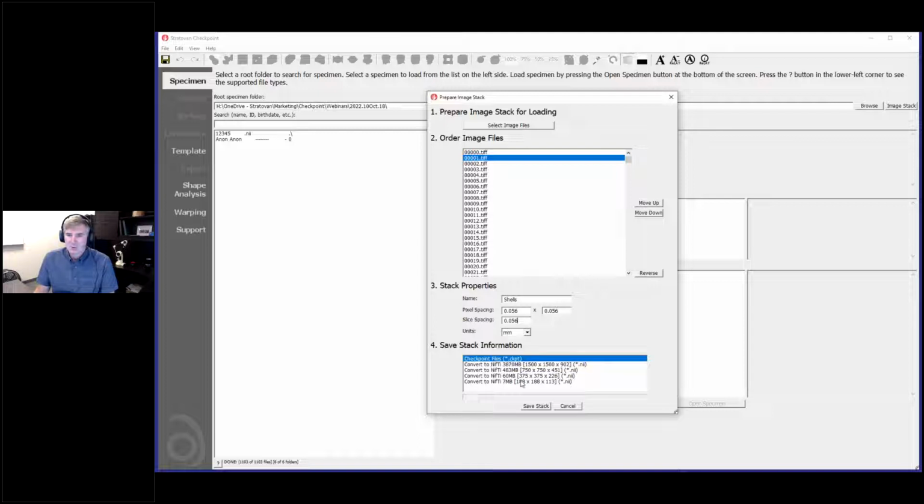So the different output files are, one, you can just do a checkpoint file, and then the checkpoint file would go next to where the TIFF images are. And then when you go to load the file, the next time you would actually load the checkpoint file, which then has a reference to the image files. You could do it that way.